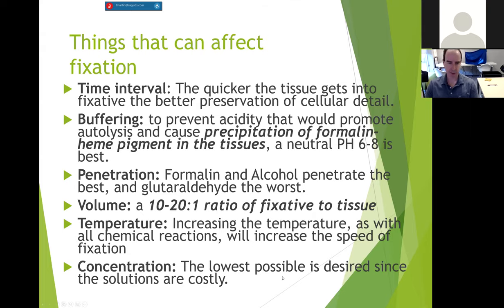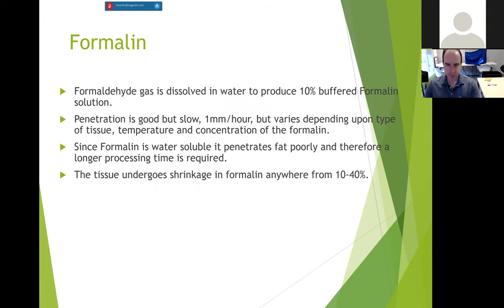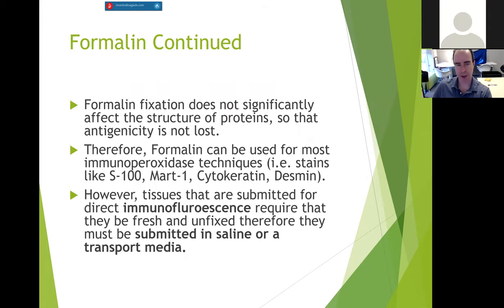So those are things to think about, but we talked about the buffering and whatnot. I'm going to skip through some of these. The main thing about formalin fixation is it doesn't affect the structure of proteins, so we can do immunostains on it. Okay, that's a big deal. Formalin-fixed tissue can be used for these immunostains, but you can't do immunofluorescence on formalin fixed tissue.